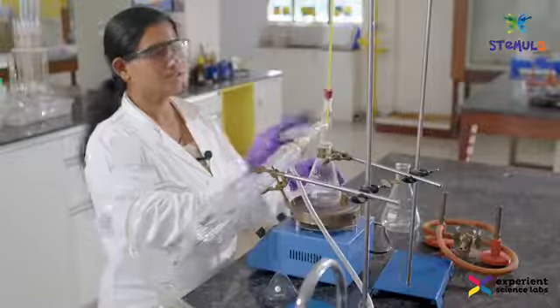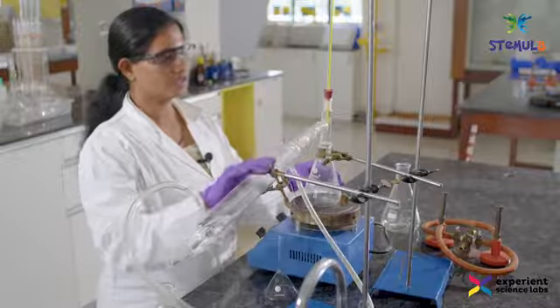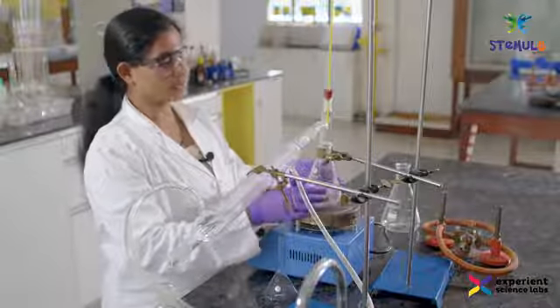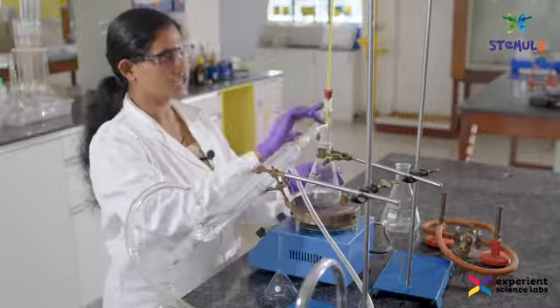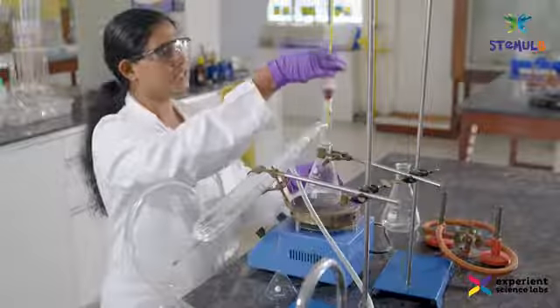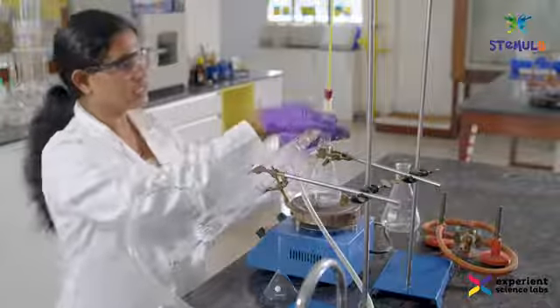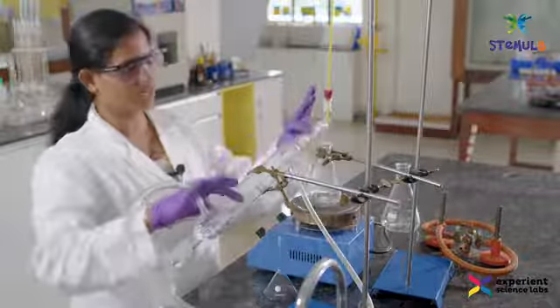To begin with, the demonstration consists of apparatus like a conical flask of around 250 ml, a distillation head, and a thermometer placed at the head of the distillate. And then this is connected to a condenser.